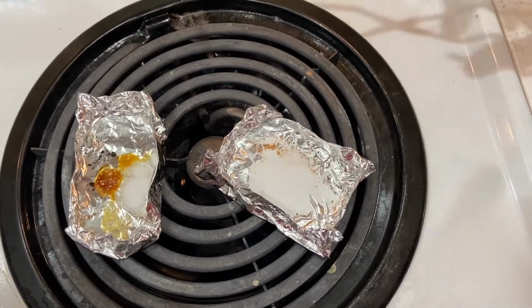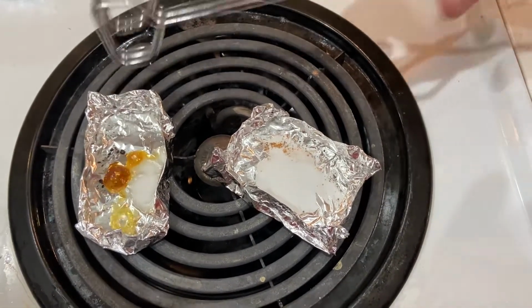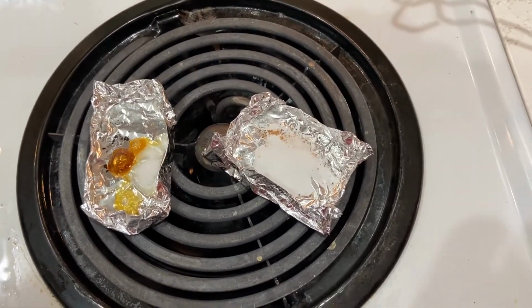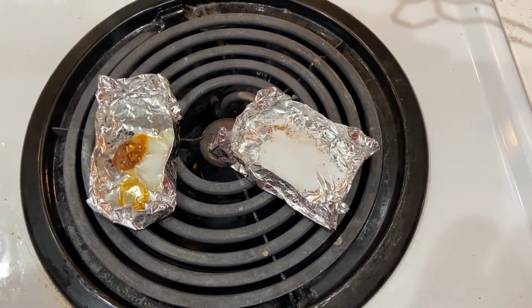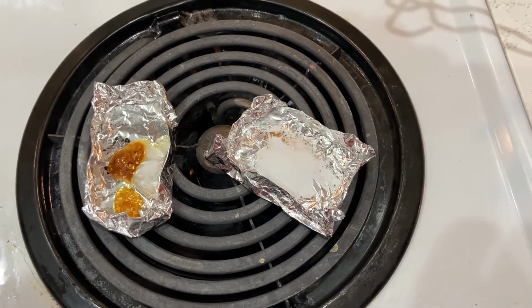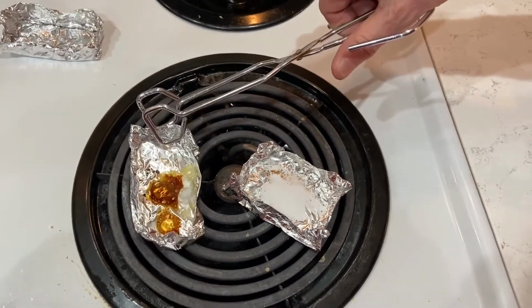You can see not only is it melting, but maybe you can see that it's giving off a gas, and it's also bubbling and changing color. So definitely substance A is melting second with a big change there.